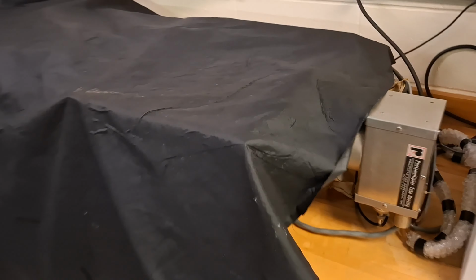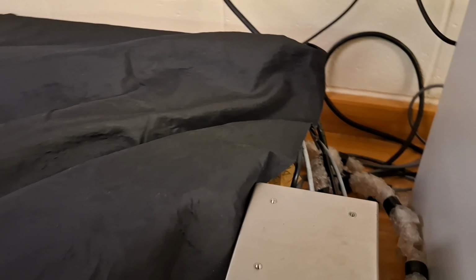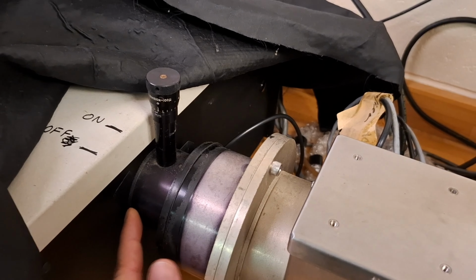So I completely cover the spectrometer. The detector part is a little bit more important, and I will turn on the slits, so right now light can go to the detector part.